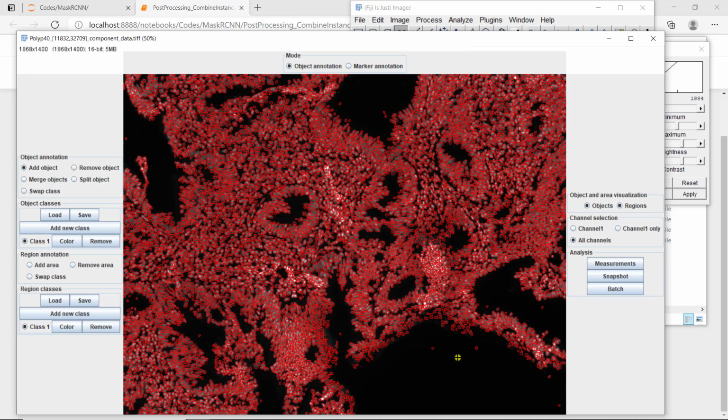But if you want better accuracy, then you need to find strategies. Here, what we clearly see is that UNet converges much faster. So with a low amount of training data, you're going to get results that are already pretty good. So maybe what you could do in a similar situation is first get the annotation for one image and use this with UNet to get preliminary results, then process a few images and manually correct them, and you can use annotator to do that. This increases the size of your training dataset, then you can retrain UNet and you can also train Mask R-CNN with this expanded training dataset, combine them to get new results, process a few images and manually correct them, and so on, until you reach an accuracy that is high enough for your application.